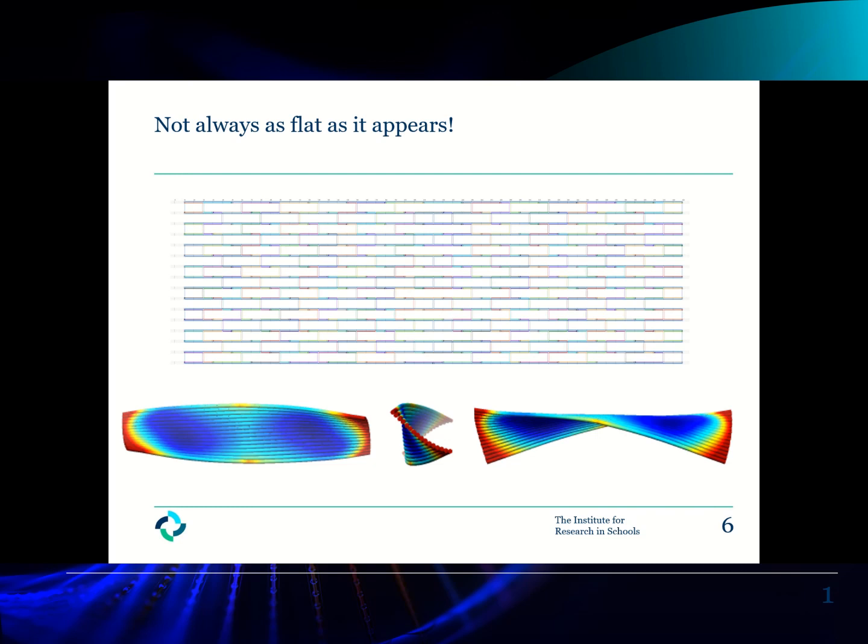There are some guidance notes available within the SCAD Nano, which will be able to help you look at this, and you might also want to find some research papers, as this would make an interesting project in itself, comparing the effect of adding this on your designs.